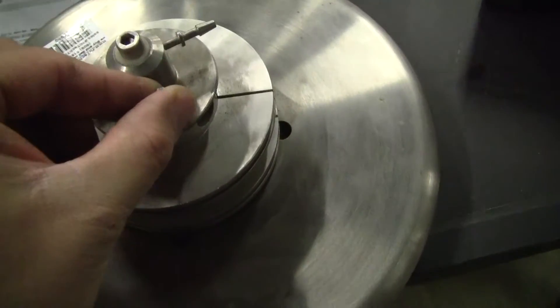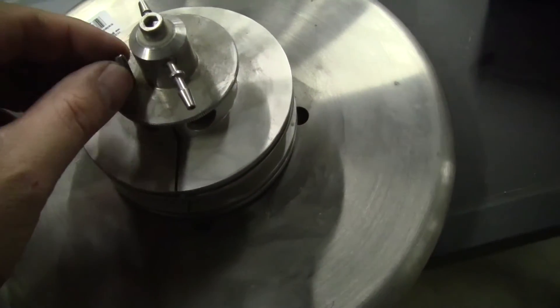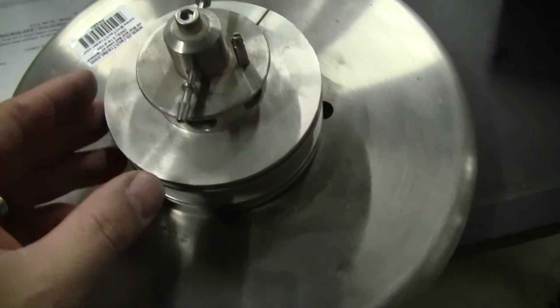I believe that just nestles in right here on the head. Not quite sure how it spins.